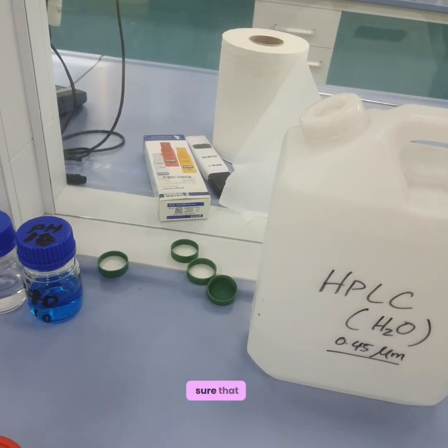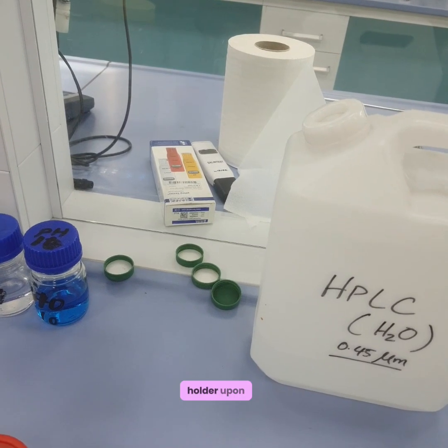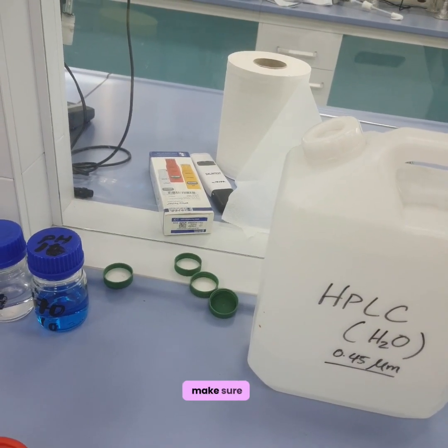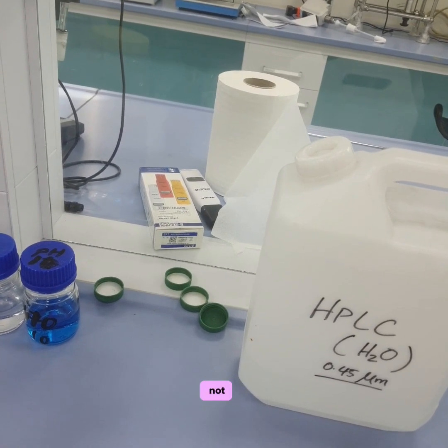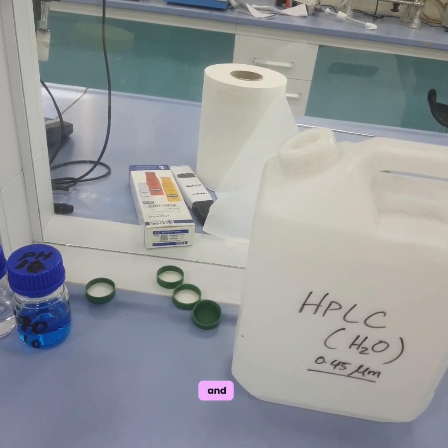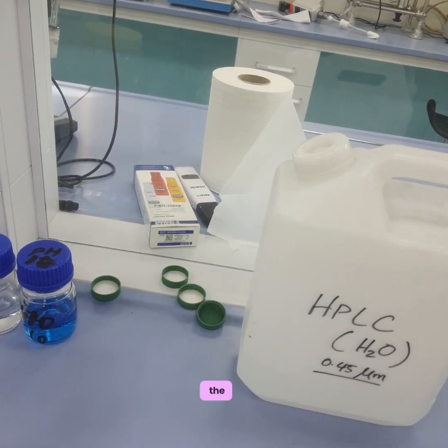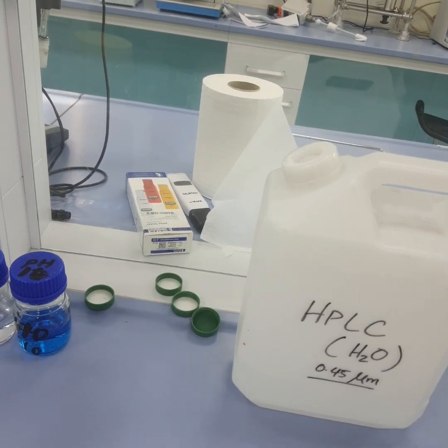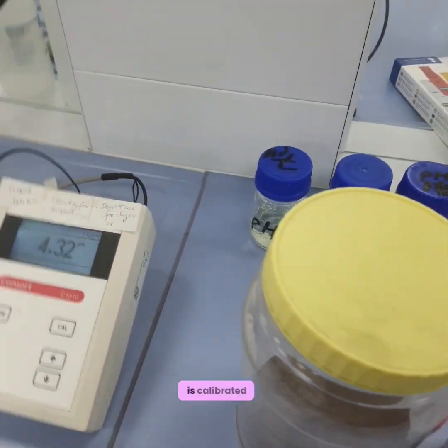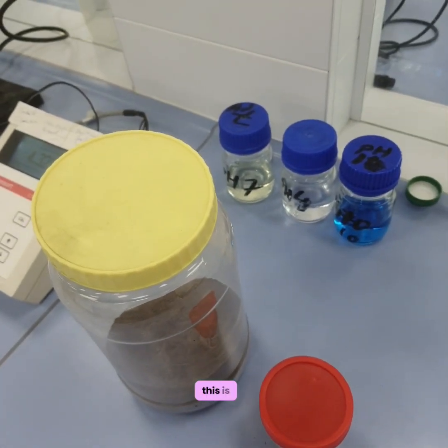We also have to make sure that the electrodes and the clamps of the holder, upon lowering the electrodes into the beaker, are well immersed and not touching the beaker, and insert the electrode into the sample solution in such a manner that it doesn't touch the bottom. So these precautions we have to make sure of. Also make sure the pH meter is calibrated. Now this is the US EPA method.